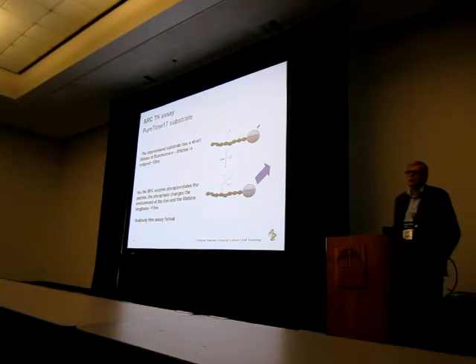To give you an example, typically if you put this dye into a well and read it on a plate, you'd be looking at around a 13 nanosecond lifetime. Of course, when you add the kinase and you come in with the ATP, you phosphorylate that tyrosine, which changes the microenvironment around the dye, and the lifetime changes significantly to greater than 15 nanoseconds.